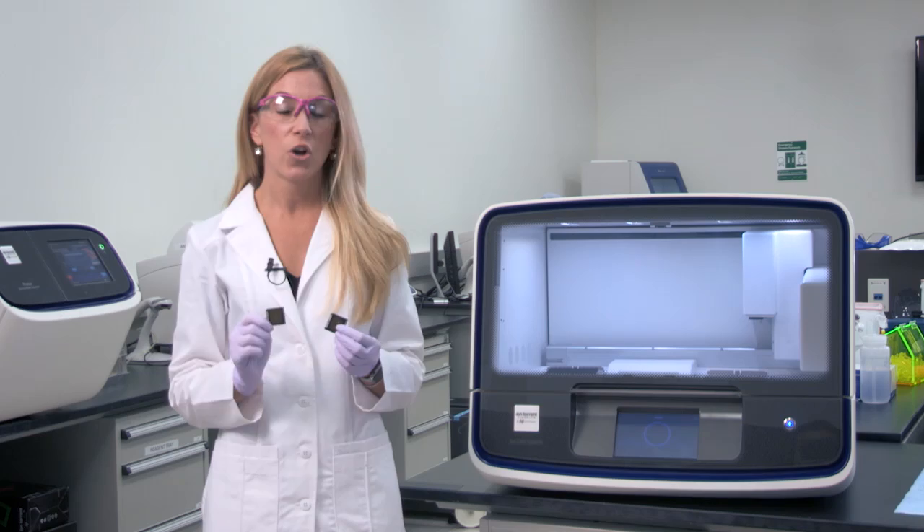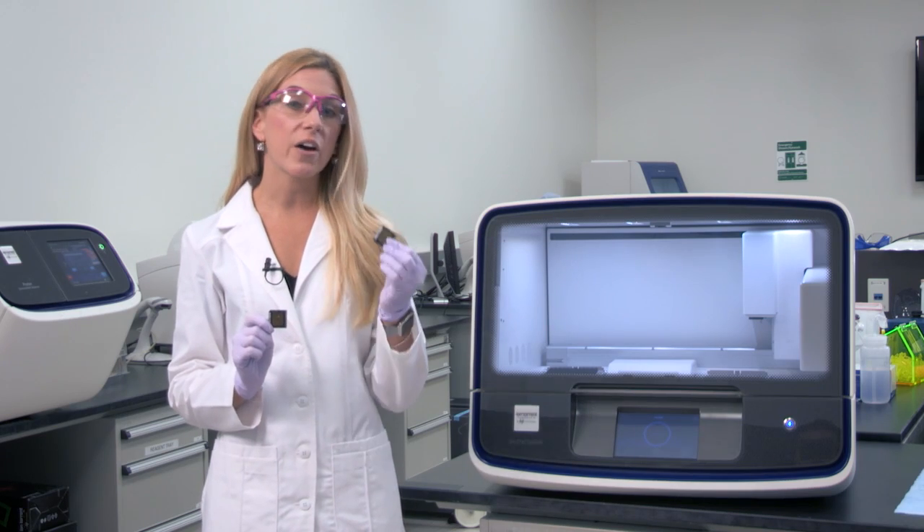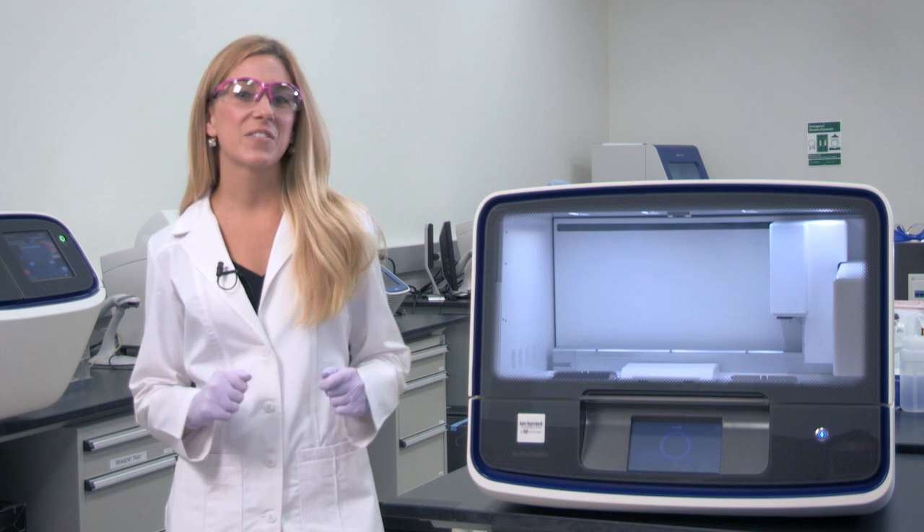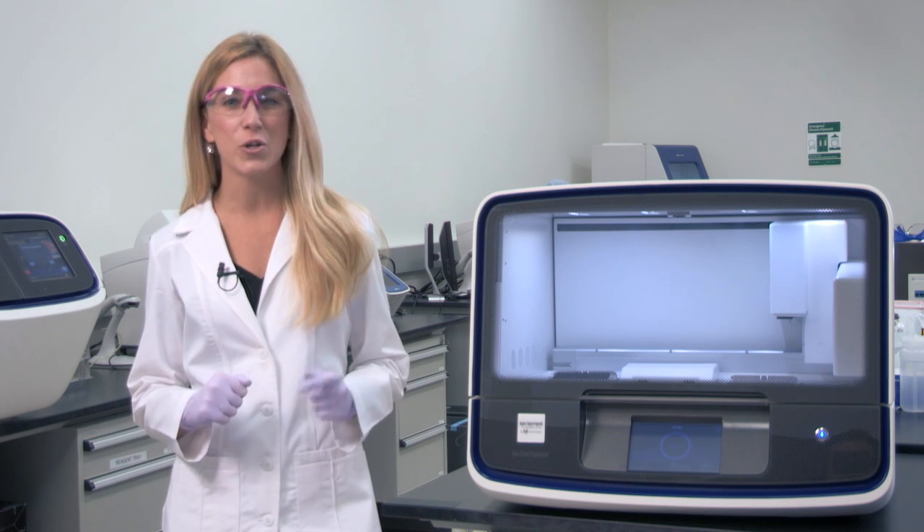Once the template protocol is completed, you'll have two loaded chips ready for sequencing, just like these two here. One can go on the sequencer, while the other can be stored at four degrees Celsius until the first run is completed. That's it in a nutshell. The Ion Chef system is flexible enough to automate your library generation, template preparation, and chip loading — it really lives up to its name as your personal sous chef in the lab. For more information on the Ion Chef, please go to thermofisher.com/ionchef.